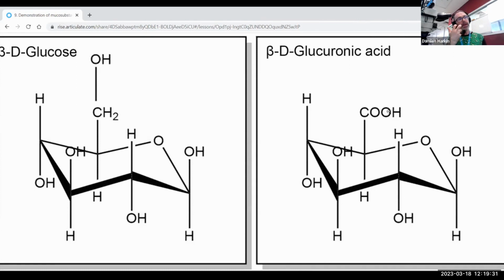So when we talk about negative charges in histochemistry, we are talking about structures that are behaving as acids. Think of nucleic acids and the previous videos that I've made about staining with hematoxylin. The positively charged complex of hematoxylin and the aluminium mordant, which is commonly used, will bind to the negatively charged nucleic acid within the chromatin. And so we'll see nuclear staining. So this is a rather similar principle.